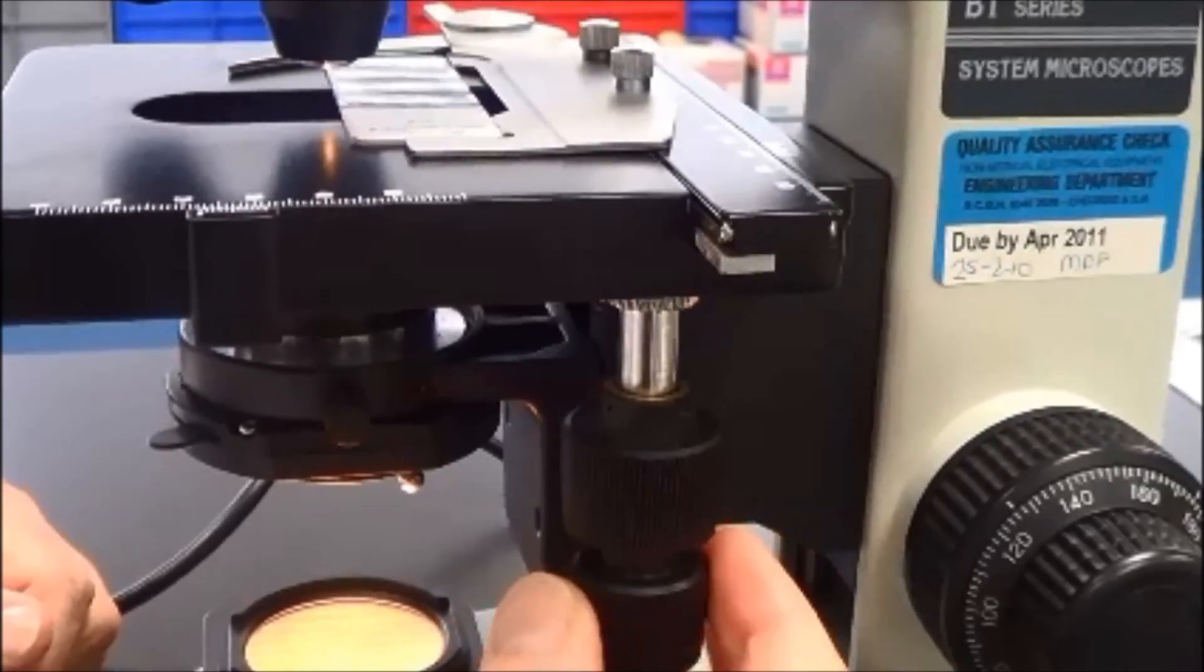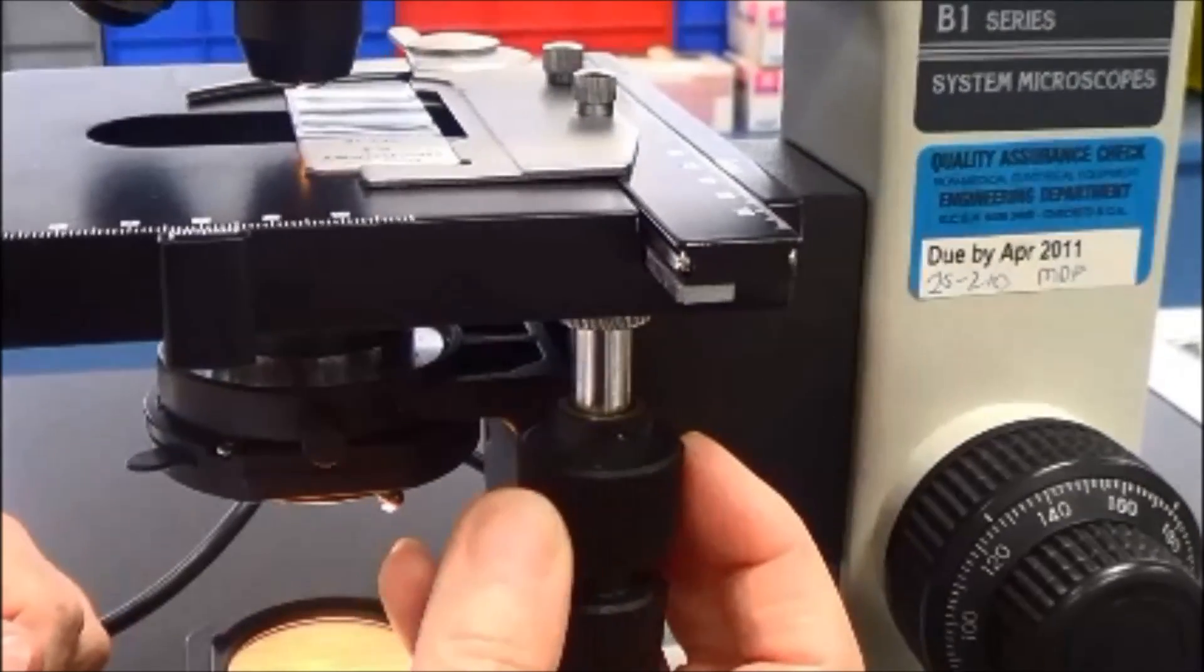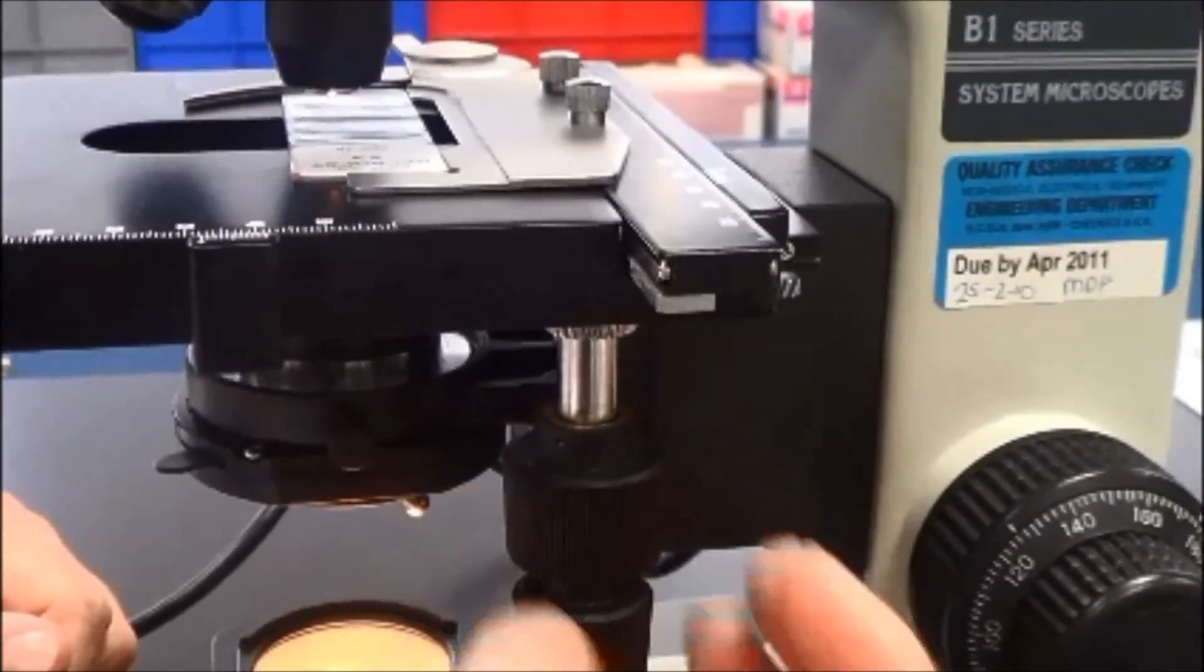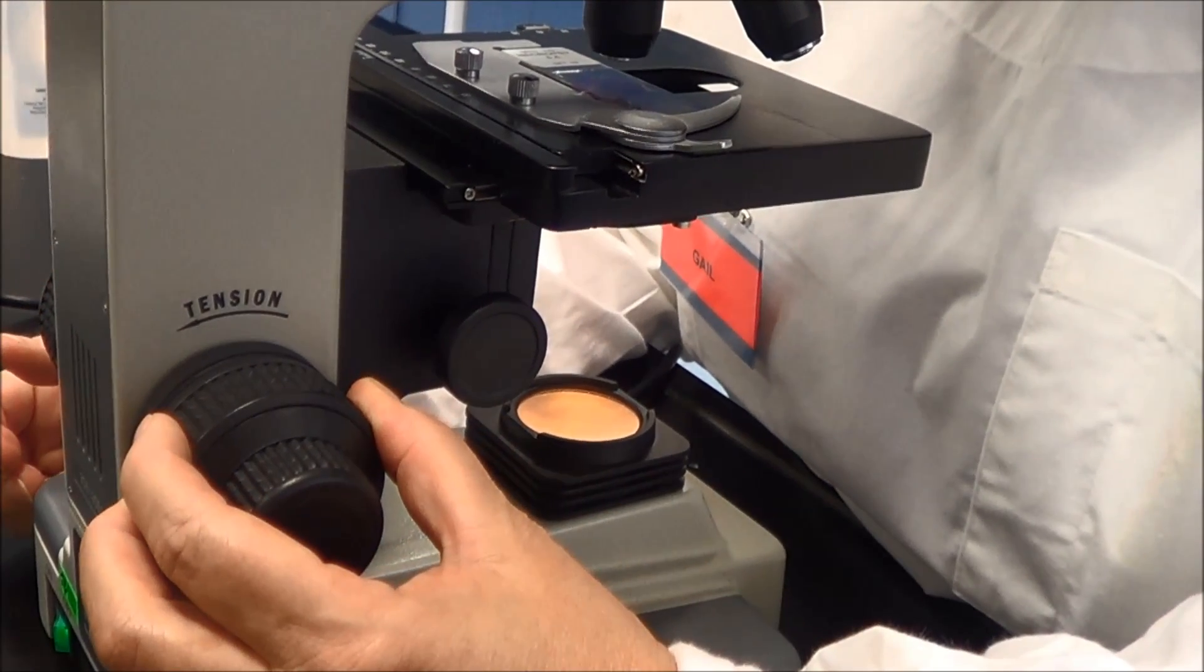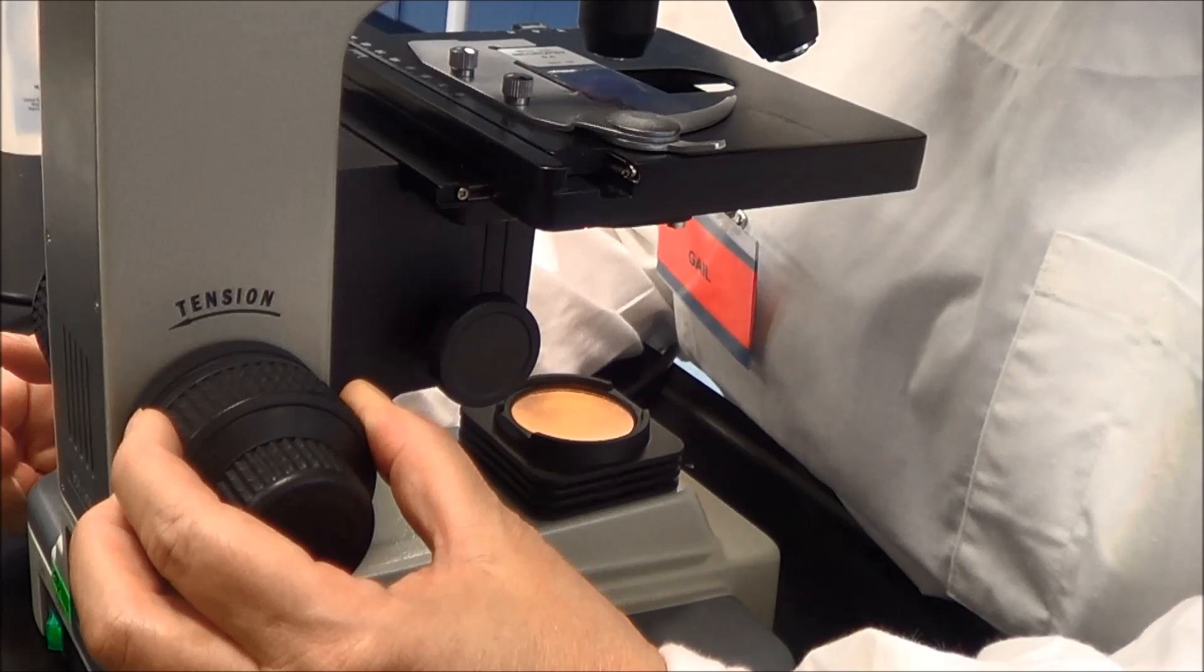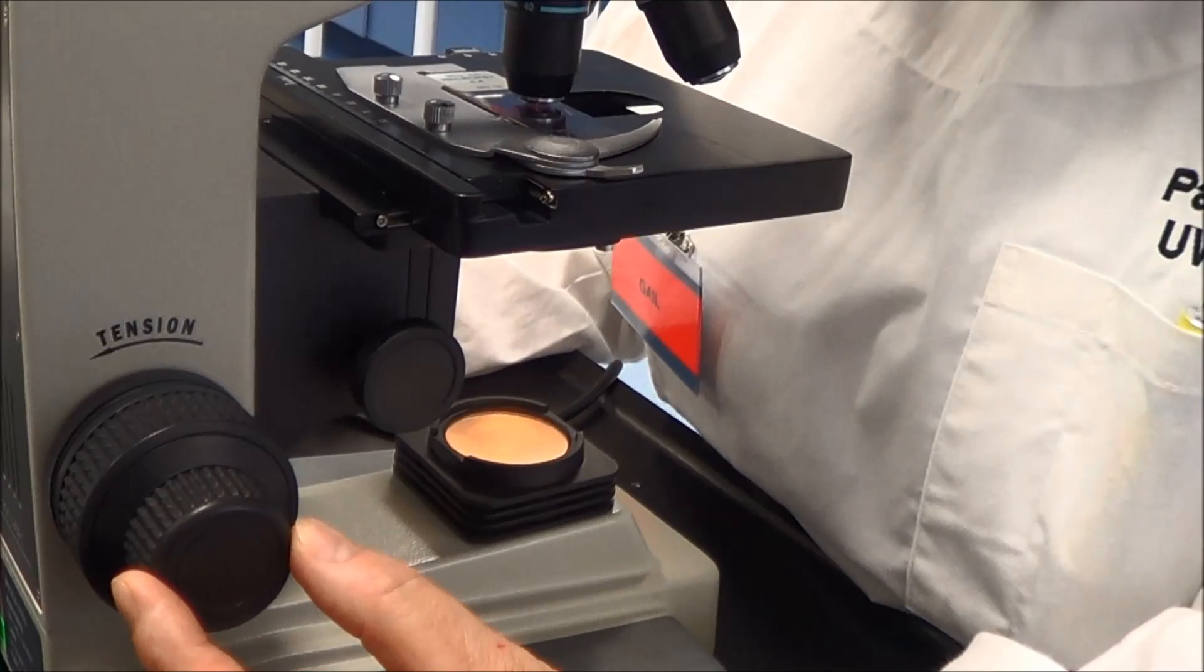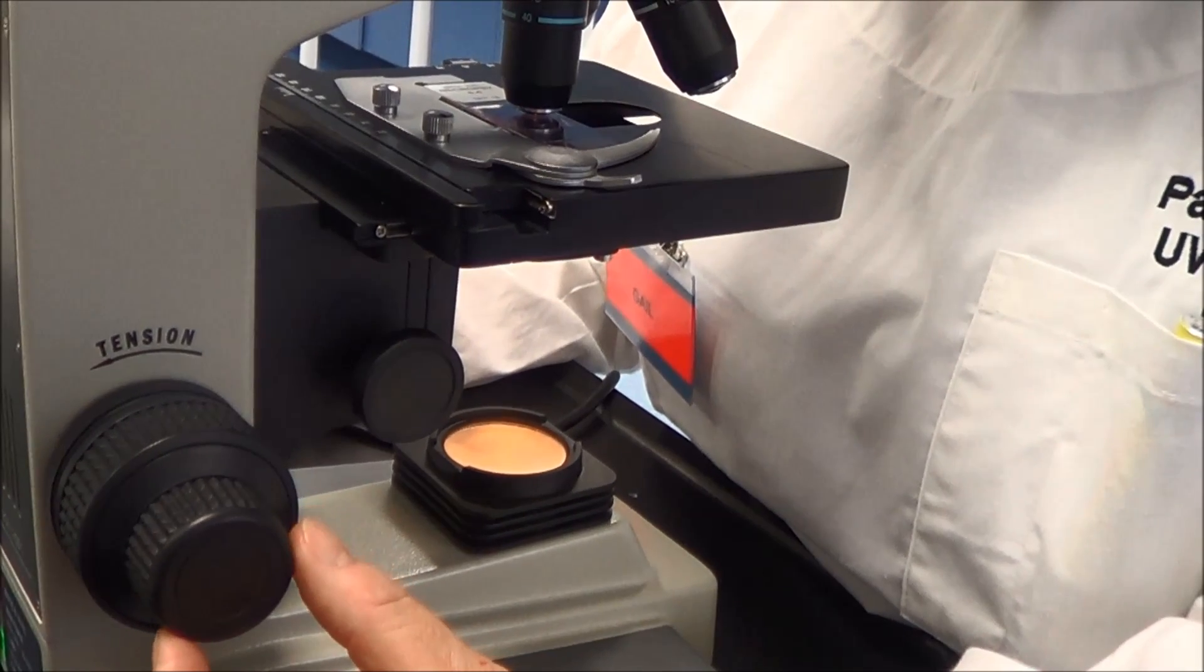Move the slide using the mechanical stage adjustment so that the area of interest is in the field of view. Use the coarse focus control to focus the image by winding gently anti-clockwise until the image appears sharp. Then use the fine focus to clarify the image.